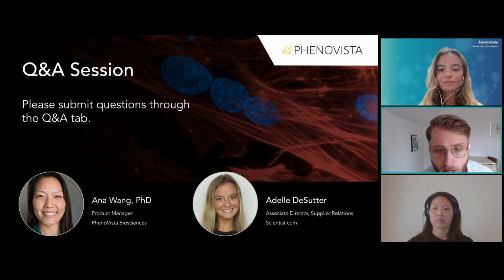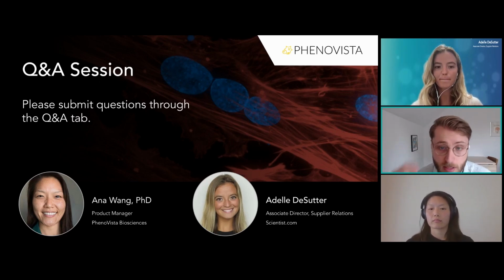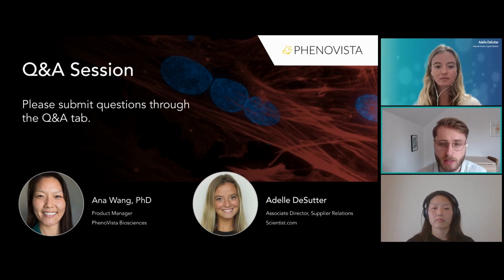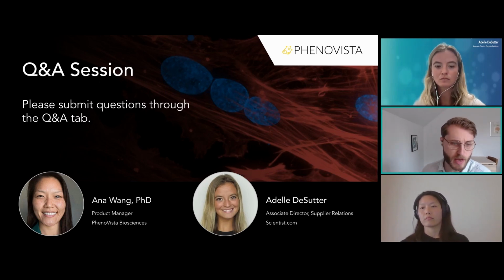So first question of the day. When thinking about the synaptogenesis assay, this person said that they saw you had low, medium, and high density seeding conditions. Do you know what those densities were approximately? Just curious to see whether they're compatible with some other assays we use.